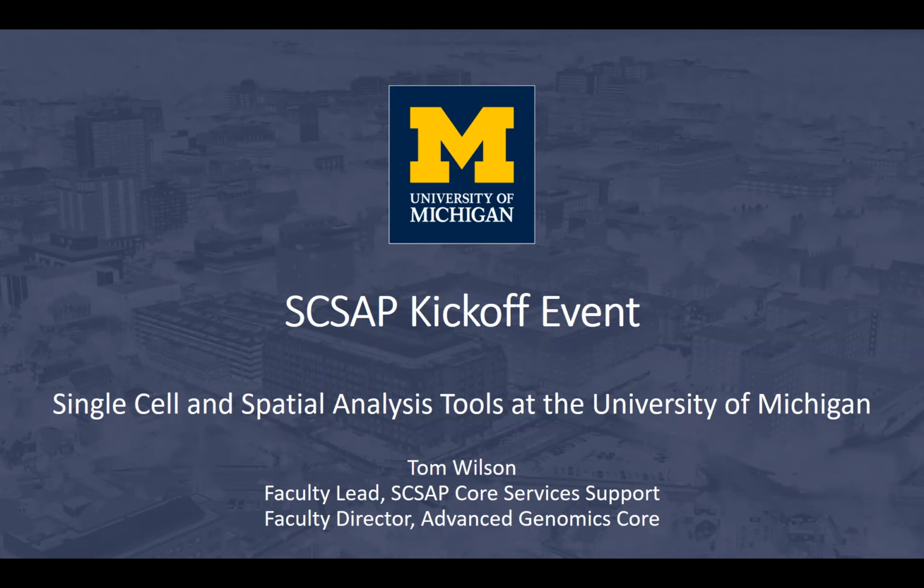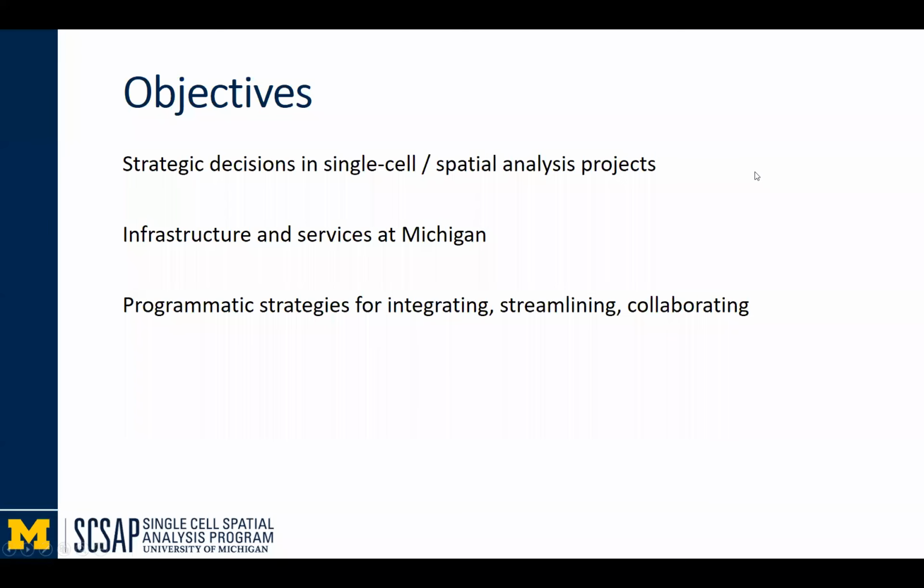And for the next 10 to 15 minutes or so, I will be getting a little more practical on thinking about how to implement single cell and spatial analysis at the University of Michigan. So my objectives for my time here are to first orient you to some of the strategic decisions that you might face when thinking about implementing single cell or spatial analysis tools in your research projects.